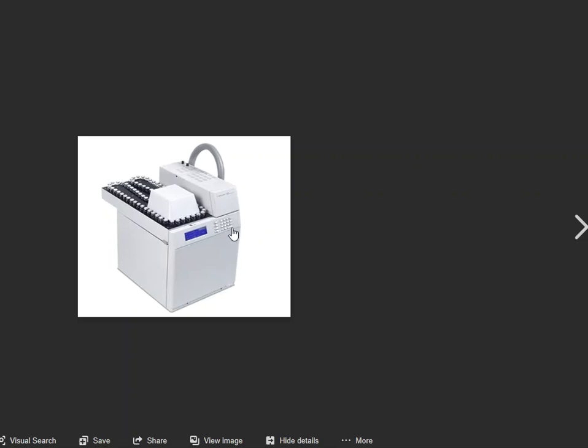So this is not software controlled mainly, at least the way that ours is set up, and some of the major ones in a laboratory are set up, unless they have a newer model. All of these are inputted through the keypad. Temperatures basically get keyed in like a phone number. Your time intervals get keyed in like a phone number. No big deal. You type in the numbers and you hit the enter button. That's all that you've got to do with the Headspace unit.